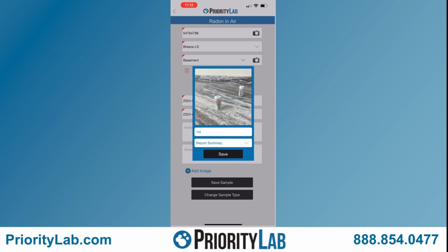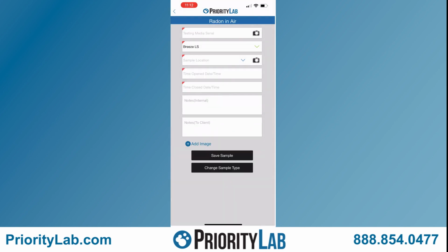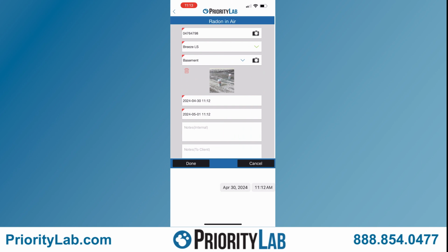Once all information is entered, we will hit Save Sample. This will prompt us to a new radon and air sample to continue entering in each canister you are deploying at that time. When all canisters have been logged in, we will back out of the screen and go over to the Samples tab. If all information is correct, we will hit Submit COC as usual. If the pickup time is not correct, we will go back into those specific COCs and update the information.